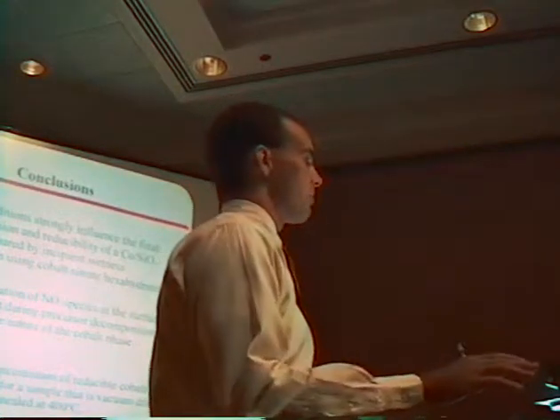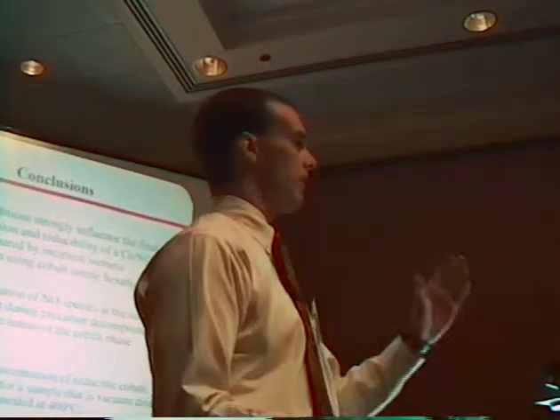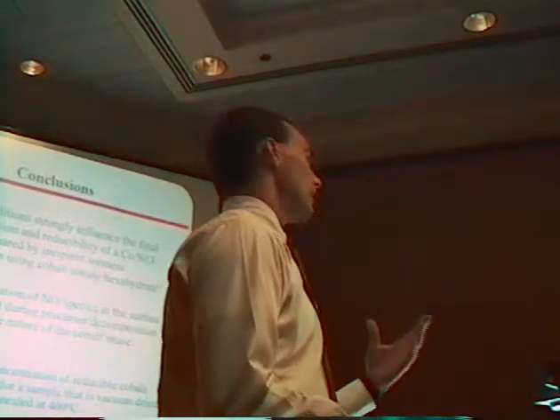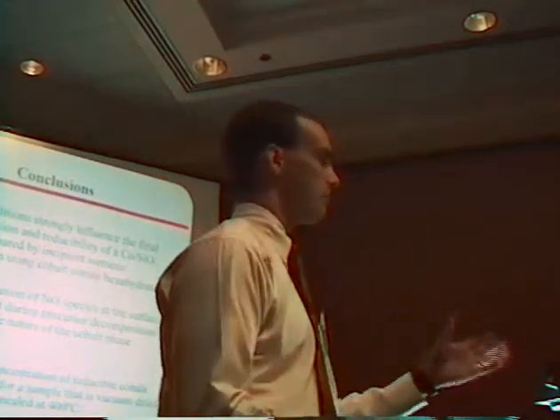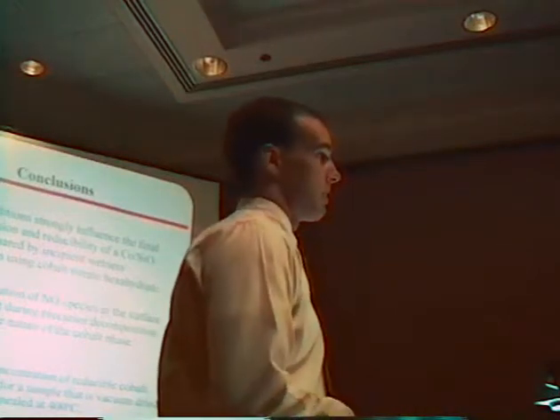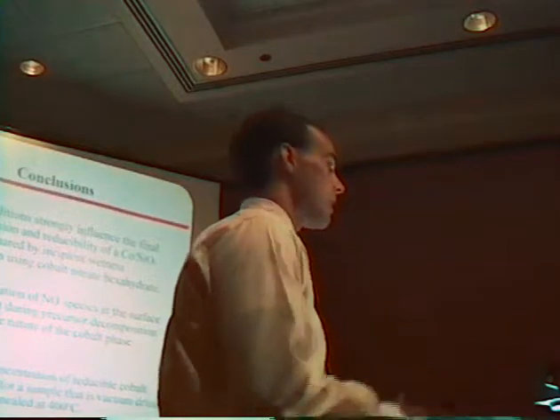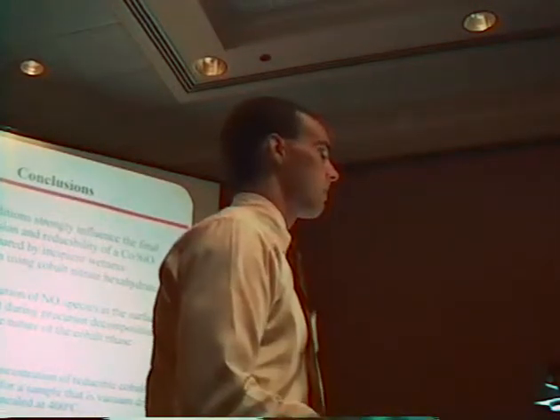They didn't do it on any type of support. They assigned a peak at 1380 to an NO3 type species, but it was a gas phase species. Oh, I see. Yes. A gas phase NO3 type species.